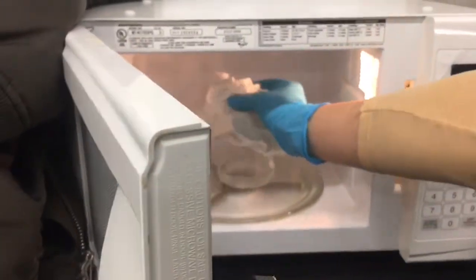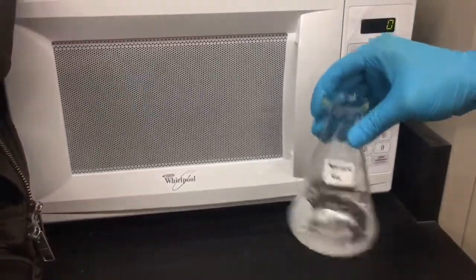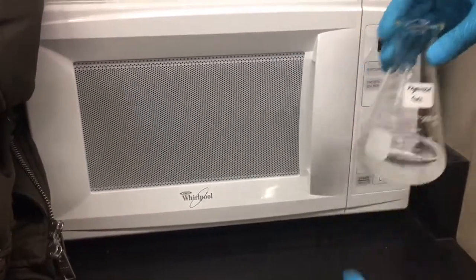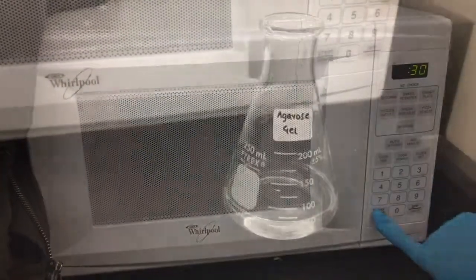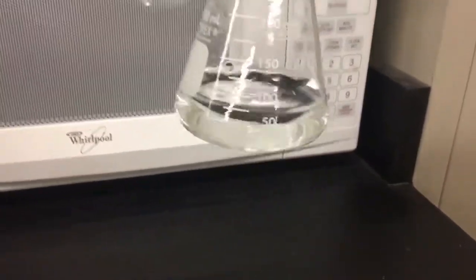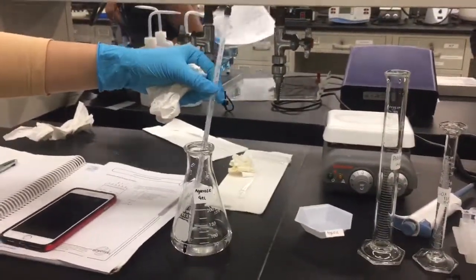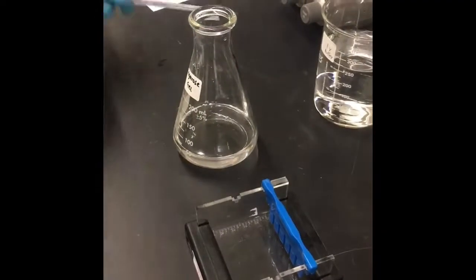Once it has heated, you take it out and you shake it to make sure all the agarose is dissolved. If not, you put it back into the microwave and heat for another 30 seconds. When all the agarose has been dissolved and the cloudiness has gone, we put it on our table with a thermometer in it to let it cool to 65 degrees.